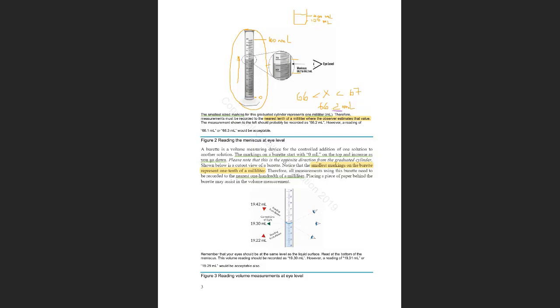I'm talking about that because the last digit is not something we know for sure. It's our eye that is looking. The other digits cannot have an error. The 66 is always going to be there, 66 dot something. But for the last digit, maybe I wear glasses, I don't see that well, and I think it's a 66.2.